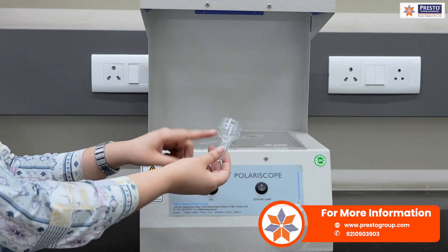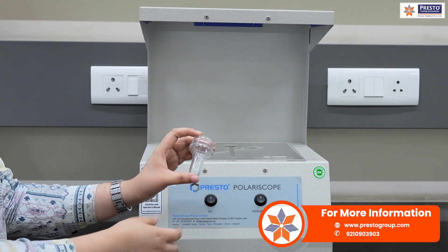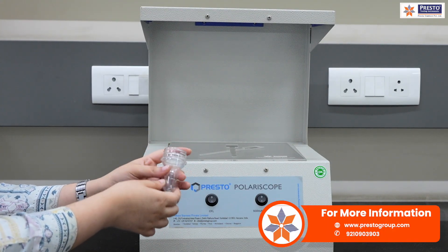Now I will be taking this small preform and I will check how optimum this sample is at the 90-degree orientation and the 45-degree orientation.